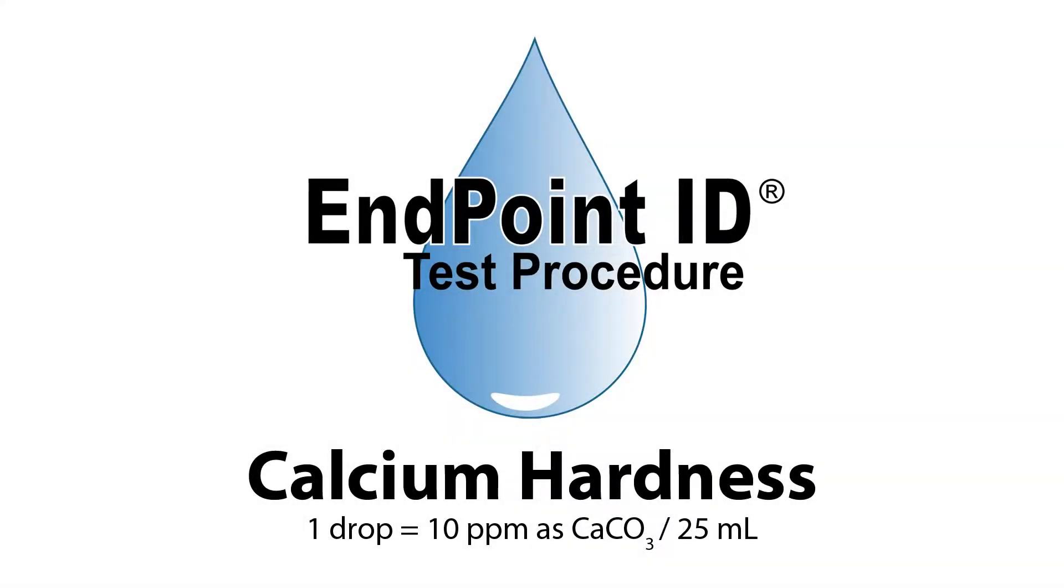This is a demonstration of a calcium hardness drop count test kit using Endpoint ID procedures.